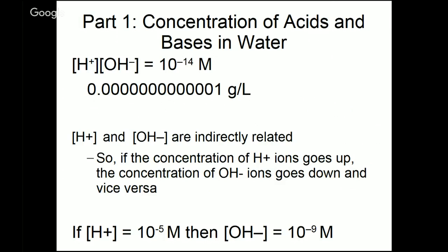Now, we've got several important concepts to cover in this lecture. In this lab, you're going to make several different solutions. You're going to make unbuffered solutions and buffered solutions. You're going to add acid to the solutions, and you're going to add base to the solutions, and you're going to see what happens to the pH as you do so. So you need to understand what's going on inside that solution.